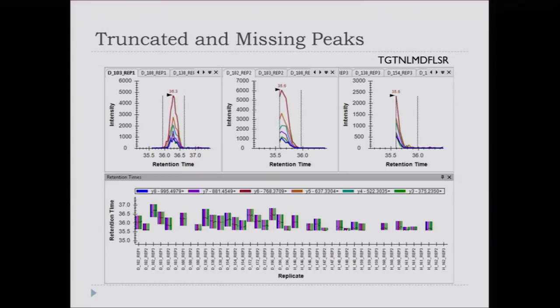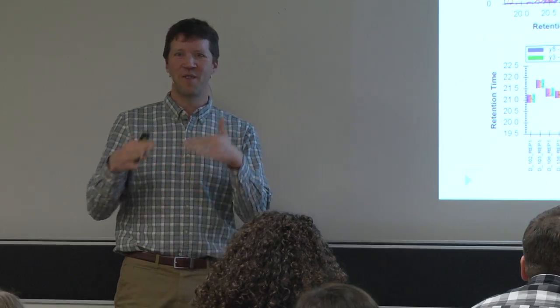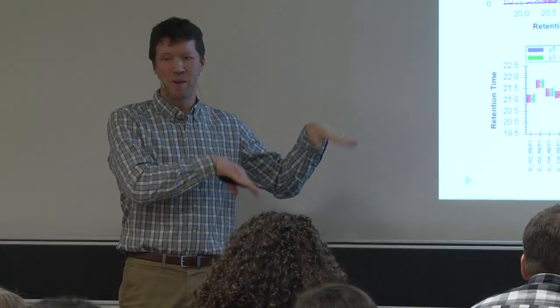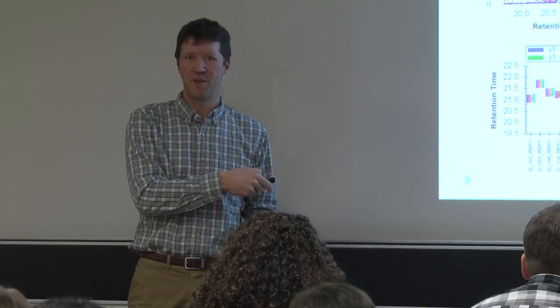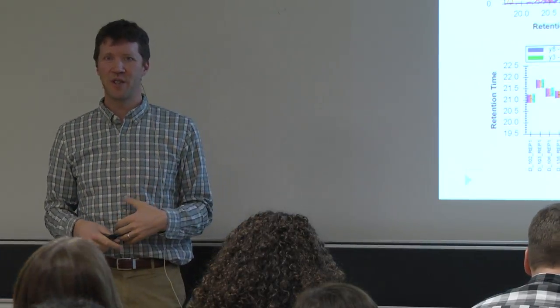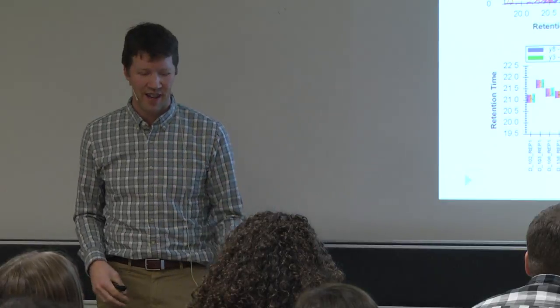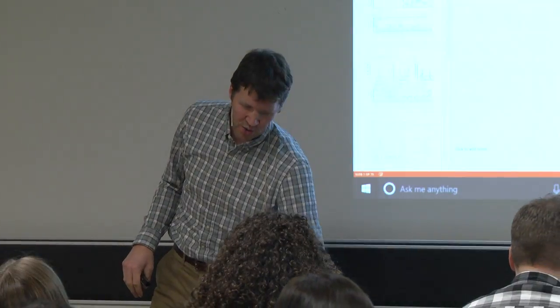But this is what it looks like. It doesn't look like this. And so I would say, if it were me, this is our differentiation. I think that this peptide, or whatever this is, I think it might be this peptide, but I would order the peptide and start investigating it. This would be an interesting peptide to follow up on. And you can learn all of this just by directed interrogation with Skyline. And I think that's it. So let's get to the data.